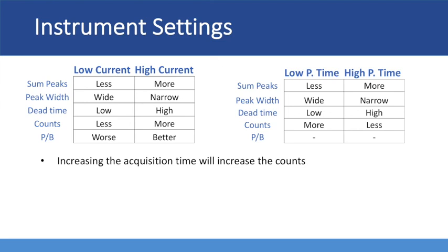One other important parameter to mention is spot size. The spot size should be set at the beginning of any analysis session when optimizing parameters. The goal when adjusting the spot size is to make it large enough to generate sufficient X-rays without damaging the sample. Furthermore, because the spot size will also affect the dead time, it should also be set so the dead time is somewhere between 15 and 60%, depending on the application you are doing, like we talked about earlier in the video.